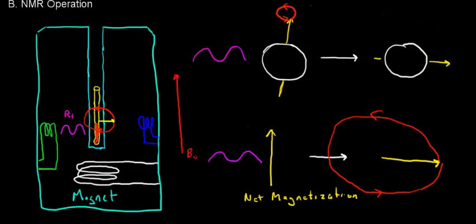And that current is what the spectrometer is detecting. Inducing a current in a coil like this with a magnetic field is known as Faraday induction. And that generates an alternating current. As this goes in one direction, the current goes one way. As it comes back around, the current goes the other way. That's an alternating current. And so with the alternating current, there's an alternating voltage.